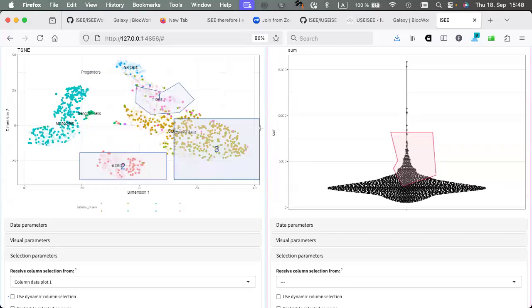Your question came up in other forms, for example, in the form of, oh, I have ATAC-seq data, and I would like to see that here. The problem is that ATAC-seq data, most of the time you want to keep it region-based. You could simply do one thing, and then you are back into the rectangular format perfectly. You compute the gene activity scores, and then you use it as if it was a table. But sometimes you want to see the peak. Sometimes you want to see the signal coverage.